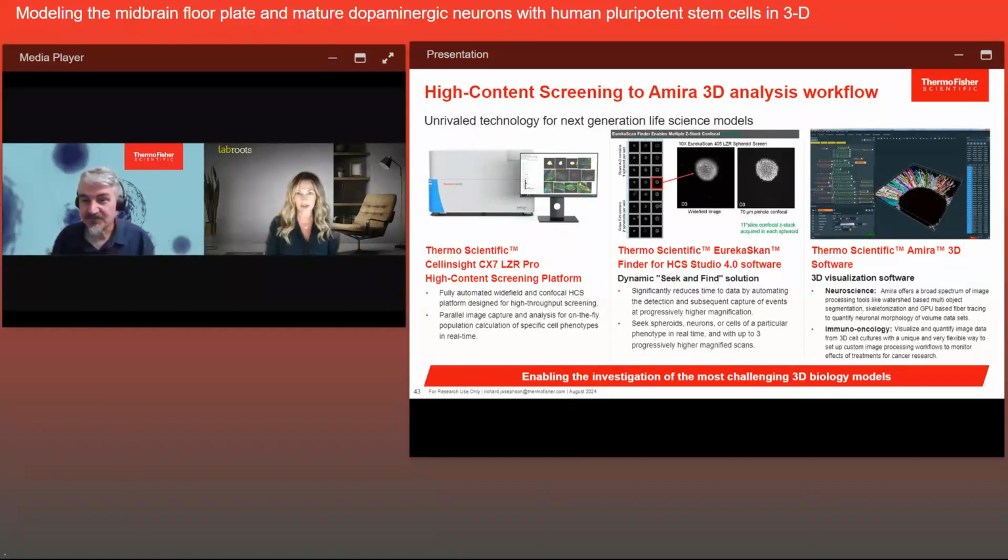Now let's stay on the topic. Oh, continue. Sorry, no, go ahead. Well, I just wanted to stay on the topic of throughput. Now, is there a higher throughput alternative to Sphera 96 well plates?